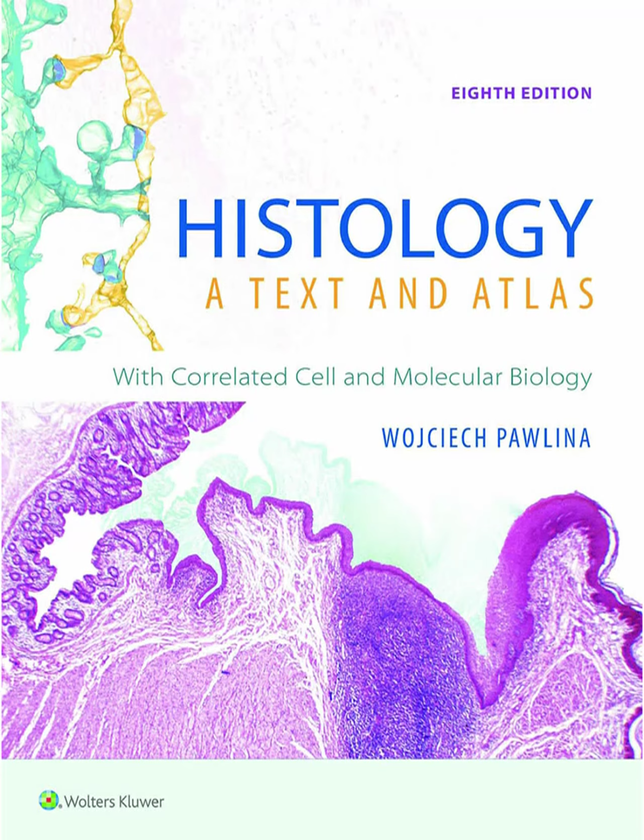Fascinating. Now, you mentioned something really cutting edge, expansion microscopy, making the sample bigger. How on earth does that work? Right, expansion microscopy, or ExM. It sounds like science fiction, but it's real. The core idea is to physically enlarge the specimen itself to overcome the resolution limits of traditional light microscopes. Physically enlarge it. Yes. You infuse the fixed tissue with chemicals that form a swellable polymer network, a hydrogel, actually similar to the stuff in baby diapers, right within the sample, anchoring the biomolecules to it. Then you digest away the original tissue proteins that would resist swelling, and you add water.